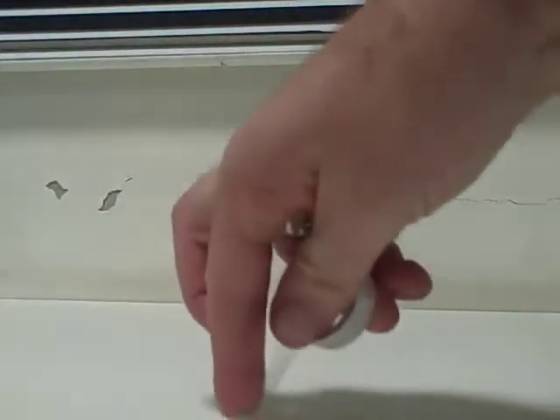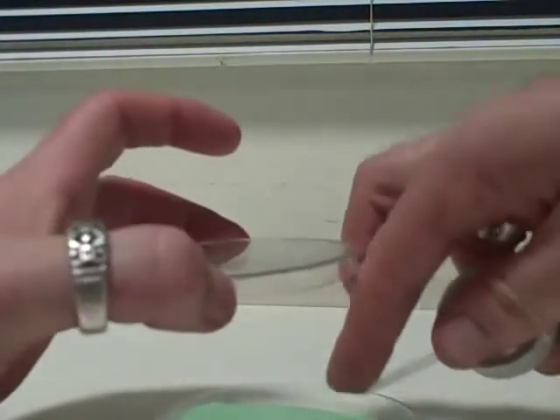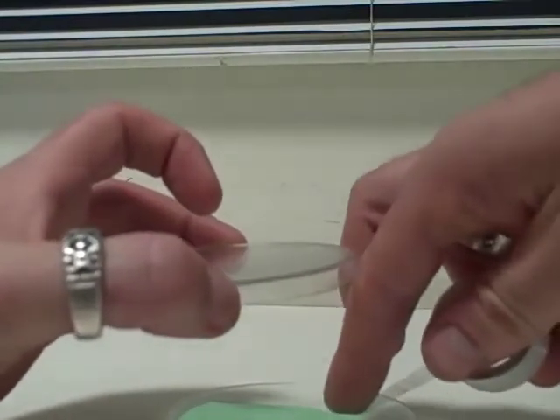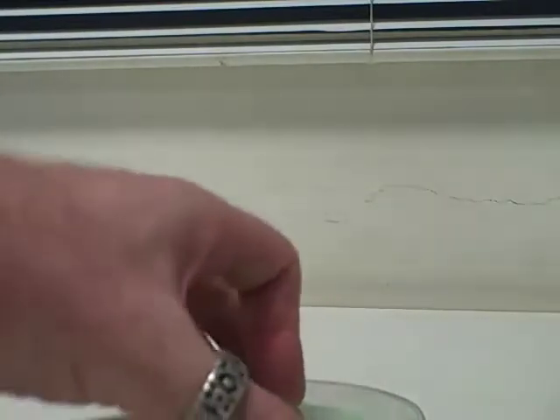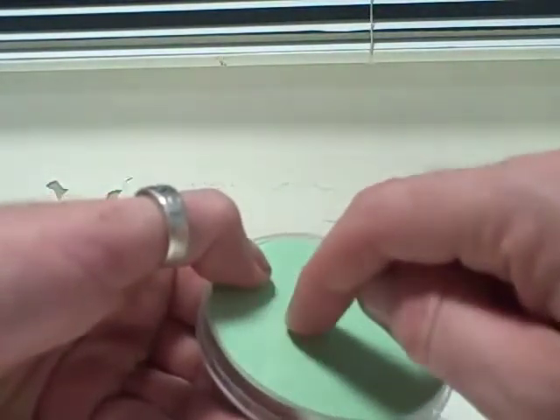Now, that piece there only ever touched the bench. I bring over my agar plate, lift the lid like this, and touch it on the jelly. I am not digging it in, just touching it gently. I won't see a thing. But I now know this corner has a sample from the bench. I'll turn it over and write lab bench here.